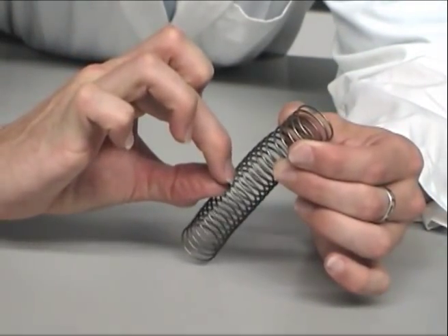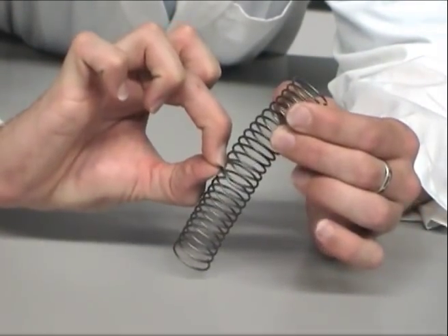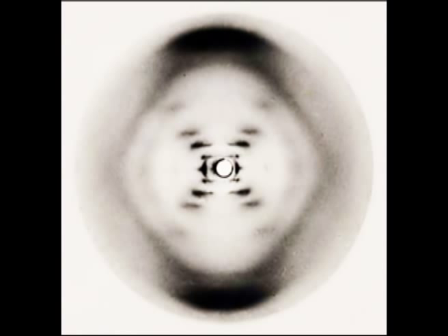One thing I can also tell is that this is a very thin helix. If it was a thicker helix, or a double helix, we would expect a missing fringe, and this is something that Rosalind Franklin understood perfectly.